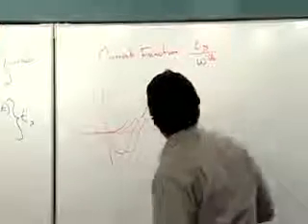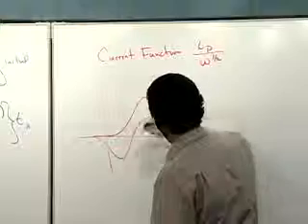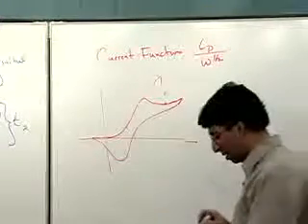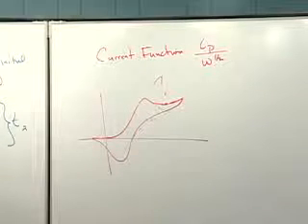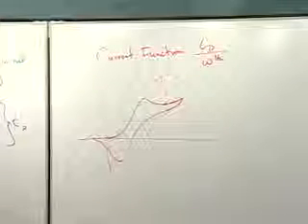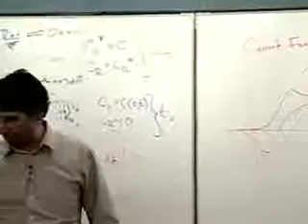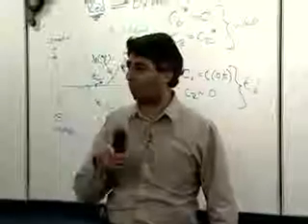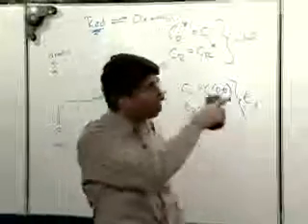Guessing becomes hard then. It's easy to guess if you have a nice cyclic voltammogram, but it becomes difficult if you have this. Probably one of the best ways of getting at the baseline, if you need a good baseline. And by the way, this baseline issue is one of the reasons that you'll find people favoring using just one of the peak currents or the peak-to-peak separation, because it's hard to do this.